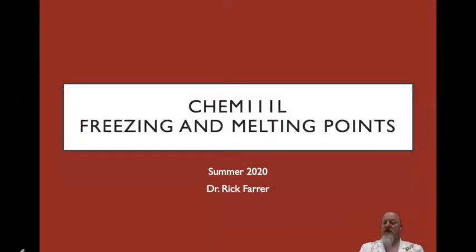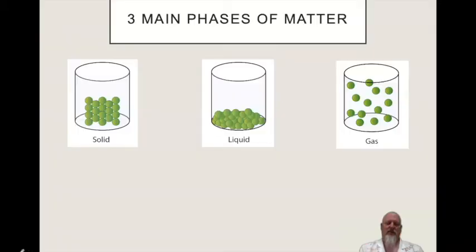So this week we're doing freezing and melting points in lab. I'm sure we all know what freezing and melting is, and we've observed it with water and things like that. But let's take a close look at what we're going to see in lab and a little bit closer look at it from a scientific perspective.